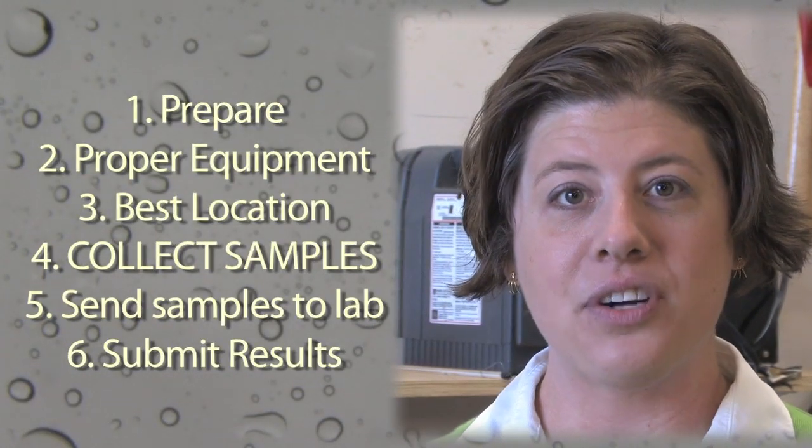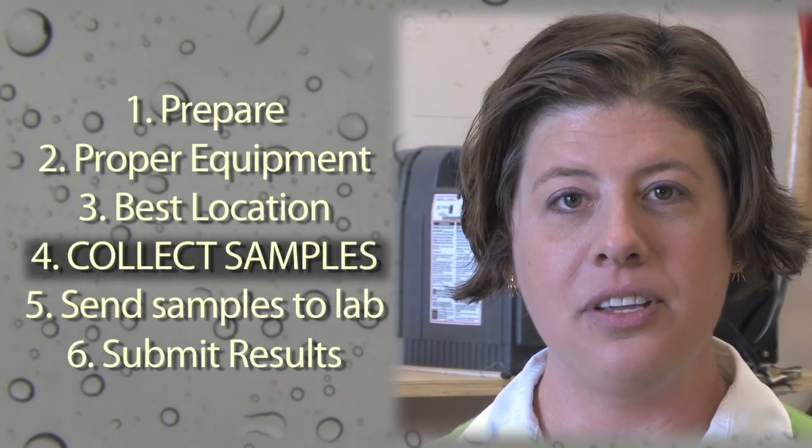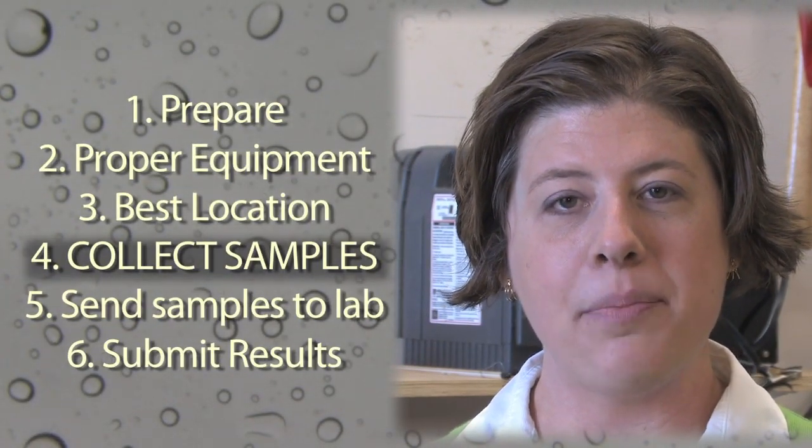The process for collecting and submitting results can be broken down into six parts. I will be demonstrating part four: how to collect a stormwater sample using the sheet flow sampling method. At the end of this video, we'll provide links to the other parts of the stormwater sampling process.